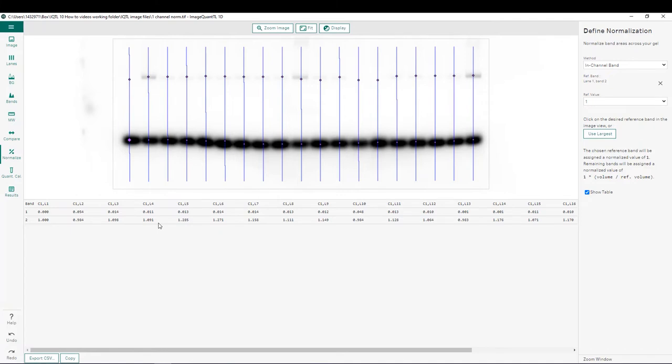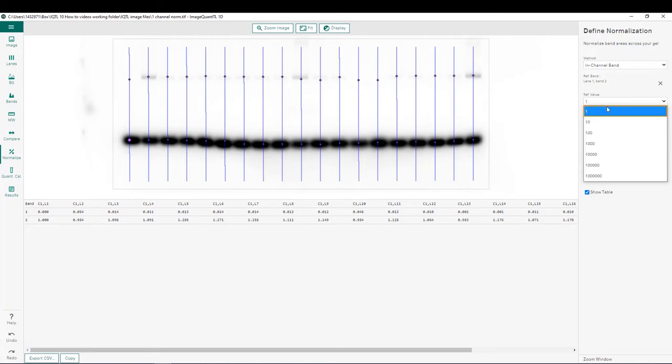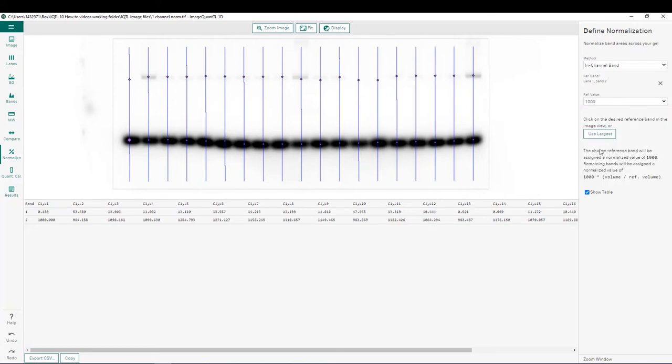If we wanted to look at the relative amount of our bands of interest, we could always adjust the reference value here, for example, to 1000, and that way we can see our relative loads of our bands of interest here as well.